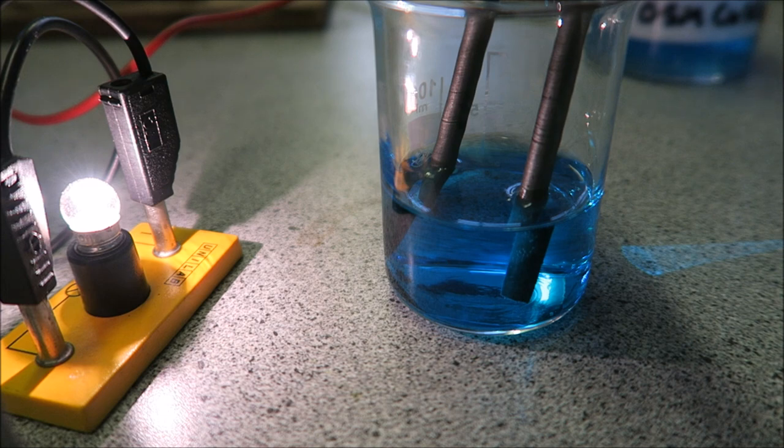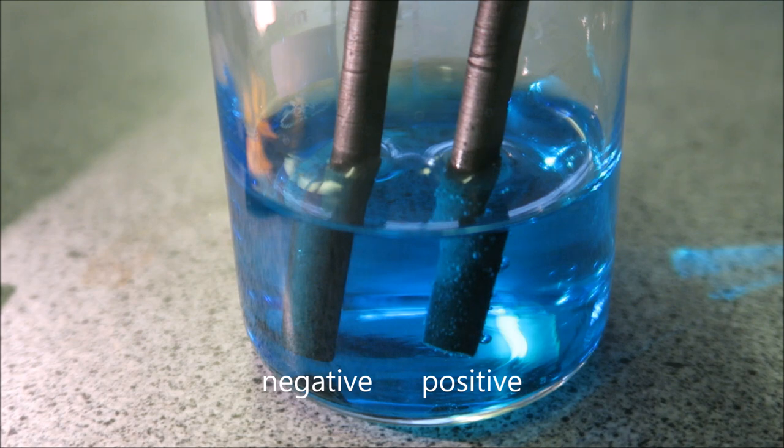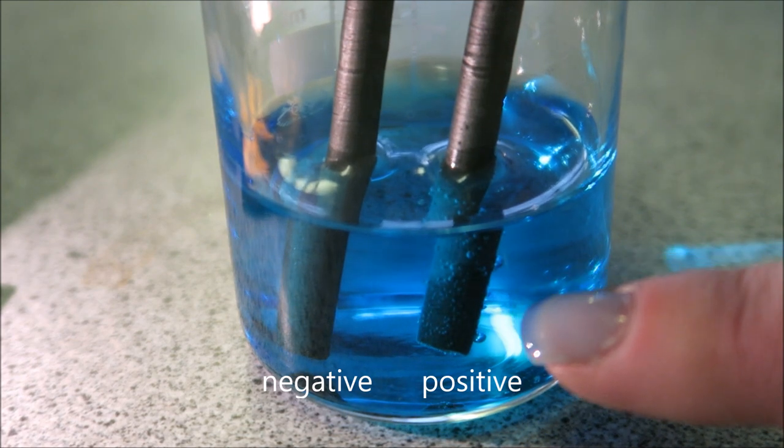Now we can just watch what happens. You can see here on the positive electrode that we have bubbles coming off.